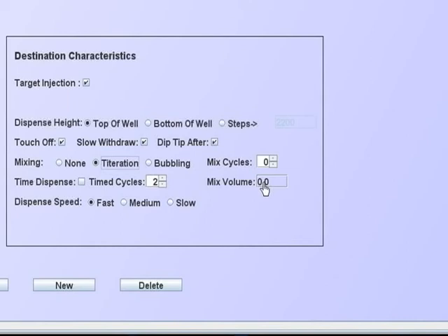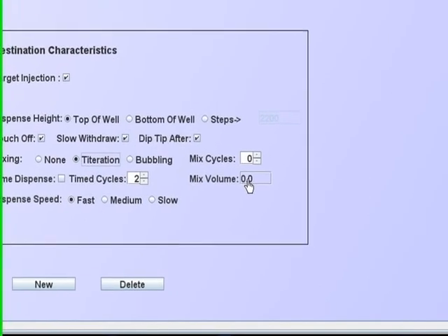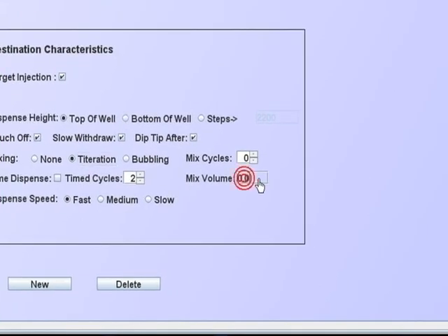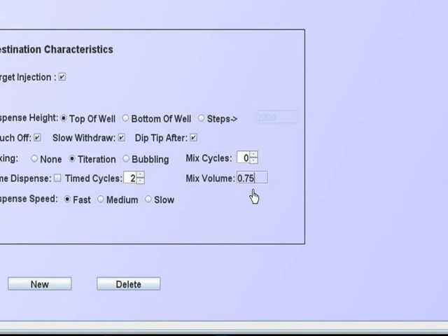The formatter software keeps track of the total volume dispensed into the well. The preferred mix volume is 75% of this volume that is dispensed to the well.